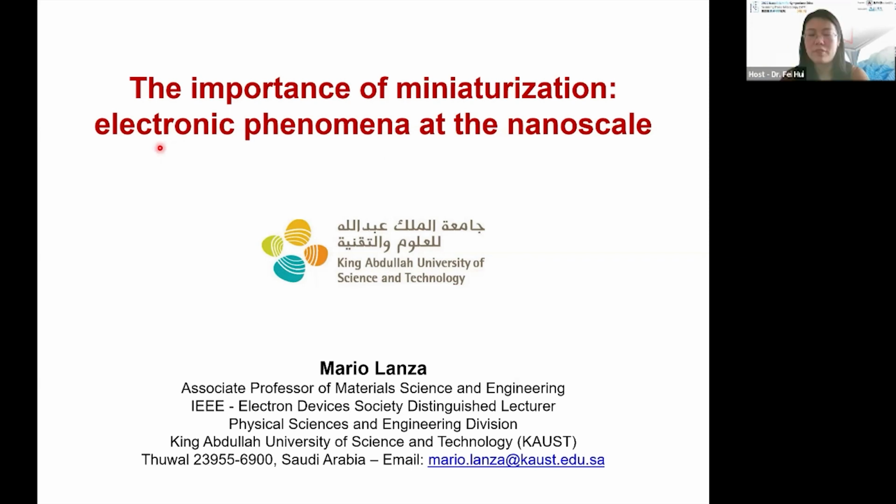Okay, thank you. So let's look at the next question. How about the repeatability of c-AFM test when measuring the resistive switching? Yeah, this is a very good question. The tips degrade fast. The tips get attached some dirt, and the system has a lateral drift. You cannot measure in one point many IV curves. It will take too long, and the tip slowly moves. And also, if you measure a little bit high currents, the current density is huge. So this is a problem.